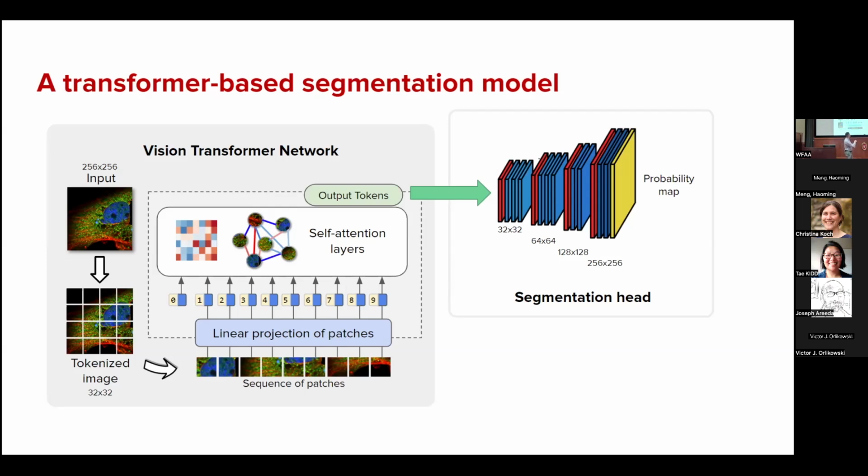Then the transformer layers analyze the relationships between all those tokens with so-called self-attention layers to figure out how they relate to each other and when a certain piece of the image makes sense for the prediction task. With the output tokens, we then reconstruct an image that only has annotations in the dots that correspond to micronuclei. This is a computationally expensive algorithm, and it requires GPU acceleration.